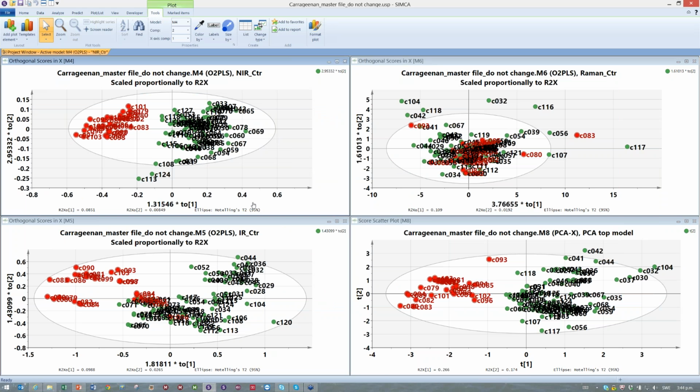It can be a moisture problem then. The other thing that we see is that it is not expressed by the Raman data at all. And the interesting thing is that we have now enabled also the NIR data and IR data to be well seen in the light of the very big Raman spectral block.